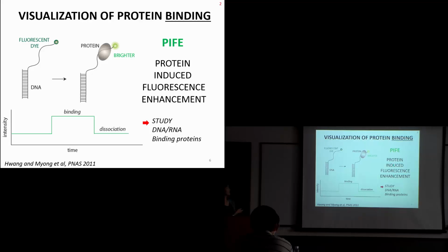Yeah. So the question of interest is how the protein interacts with the substrate, right? So we're using this as a probe to report on that. We're not really studying the photochemical effect. We're studying the protein-DNA interaction, and it's really not size dependent.